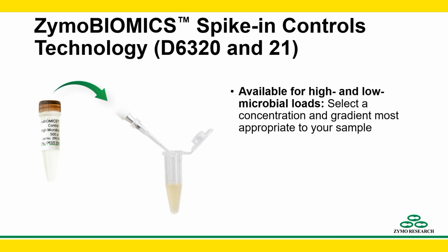These are available in high and low microbial loads, so you do need to do a little bit of guesswork here, but you need to select the concentration that's most appropriate for your sample, because that's going to decide what the concentrations are of different microbes in the standard. Obviously, you don't want to use an extremely high load if your microbial sample is extremely sparse. That could cause you to almost entirely end up reading the spike-in and miss some of the depth you'd want from your own sample.